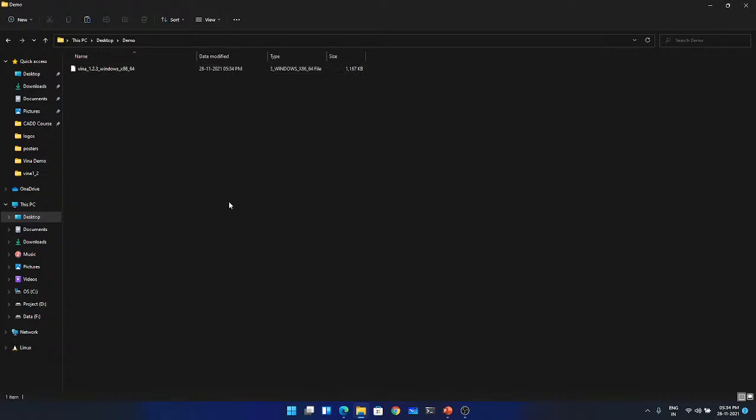To access this, we can directly use it from the command line. I will show you how that looks. We are going to need a protein and a ligand.